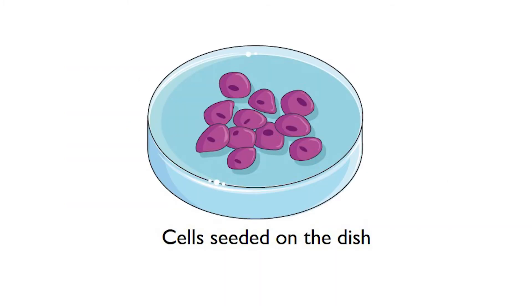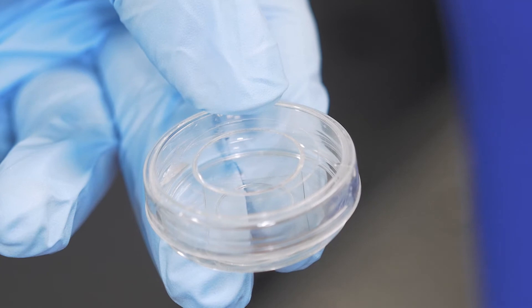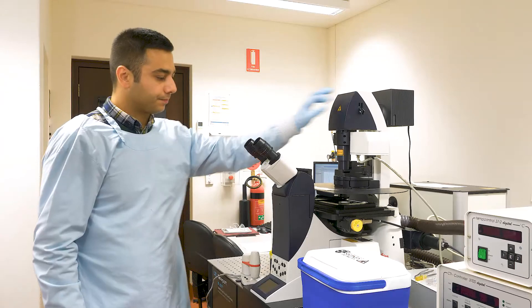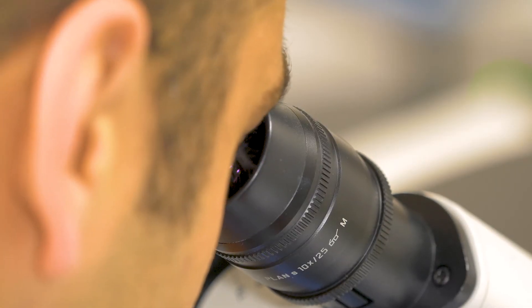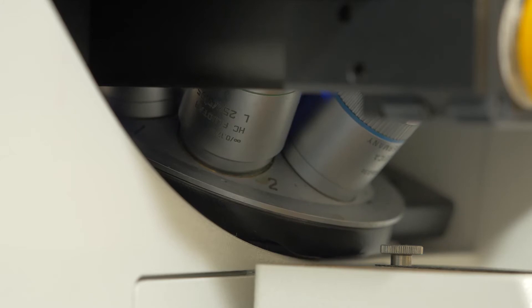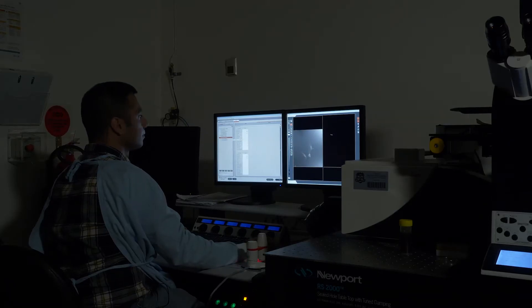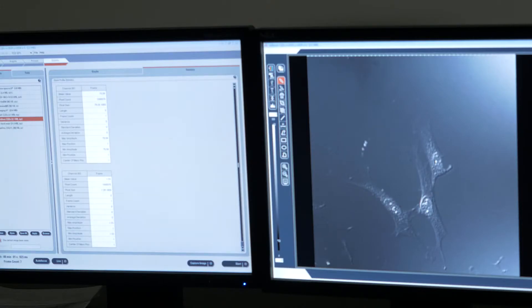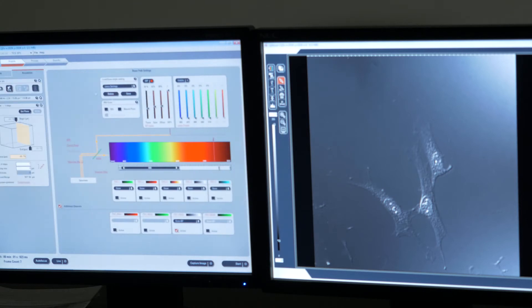I cultured some cells and seeded them on a small dish for cell imaging. I choose my ideal objective and try to focus on the cells, then we work on the computer connected to the microscope. First, we take bright field images of the cells. Bright field microscopy is the simplest of all optical microscopy illumination techniques; it relies on the differences in absorption of light due to differences in densities between various parts of the sample, which for our purposes is a cell.